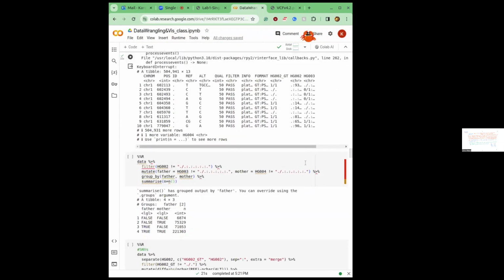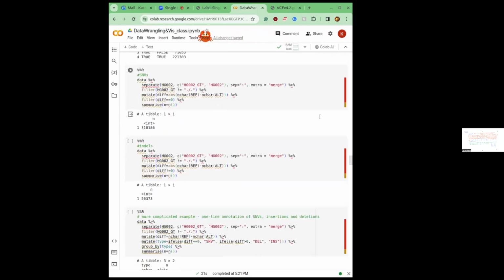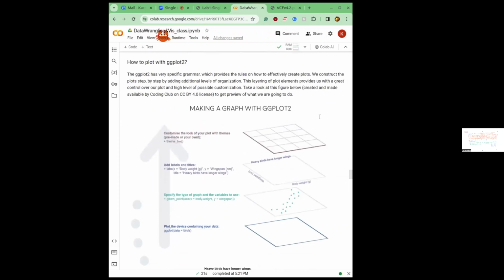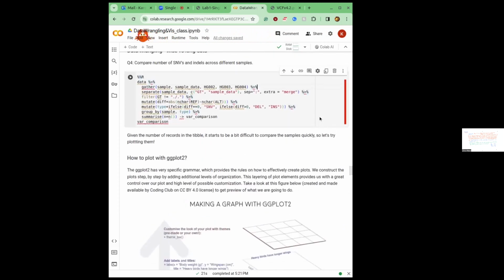This is done with the gather and spread commands in tidyverse. And if you figure out how to use them, then you are basically good to go. Gather would take the columns that you have here and change them from wide to long. And spread does the exact opposite. Usually you specify for these 2 commands a key and a value. And there are examples here in the notebook.